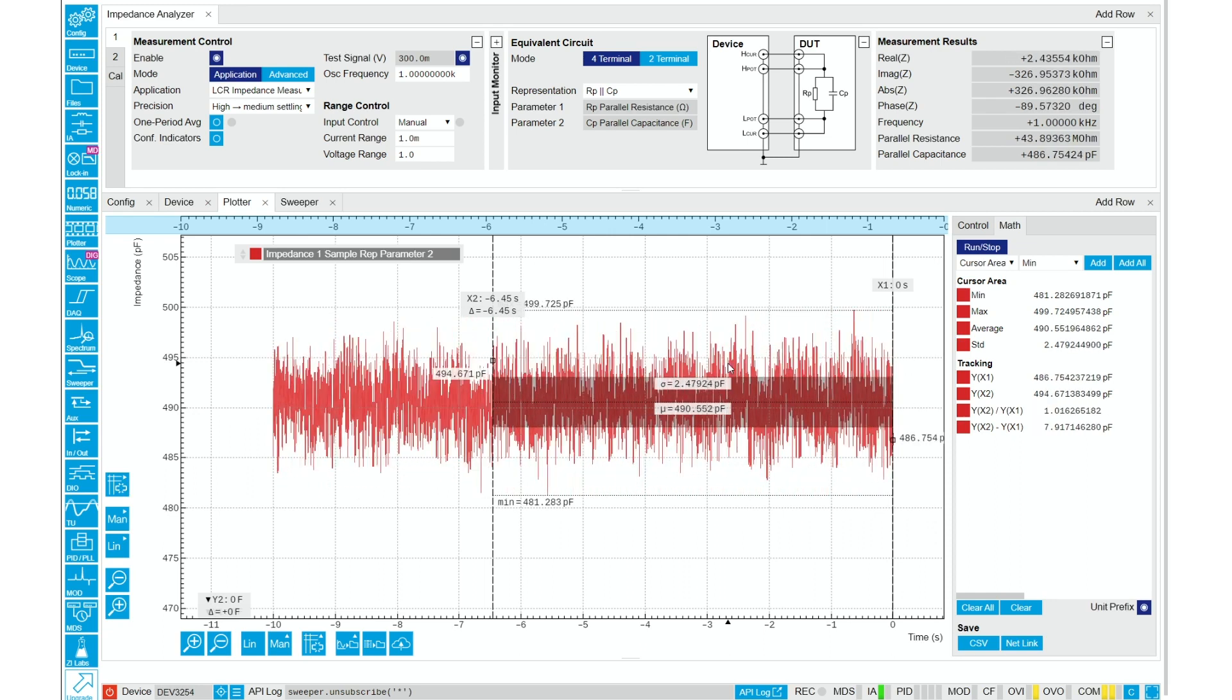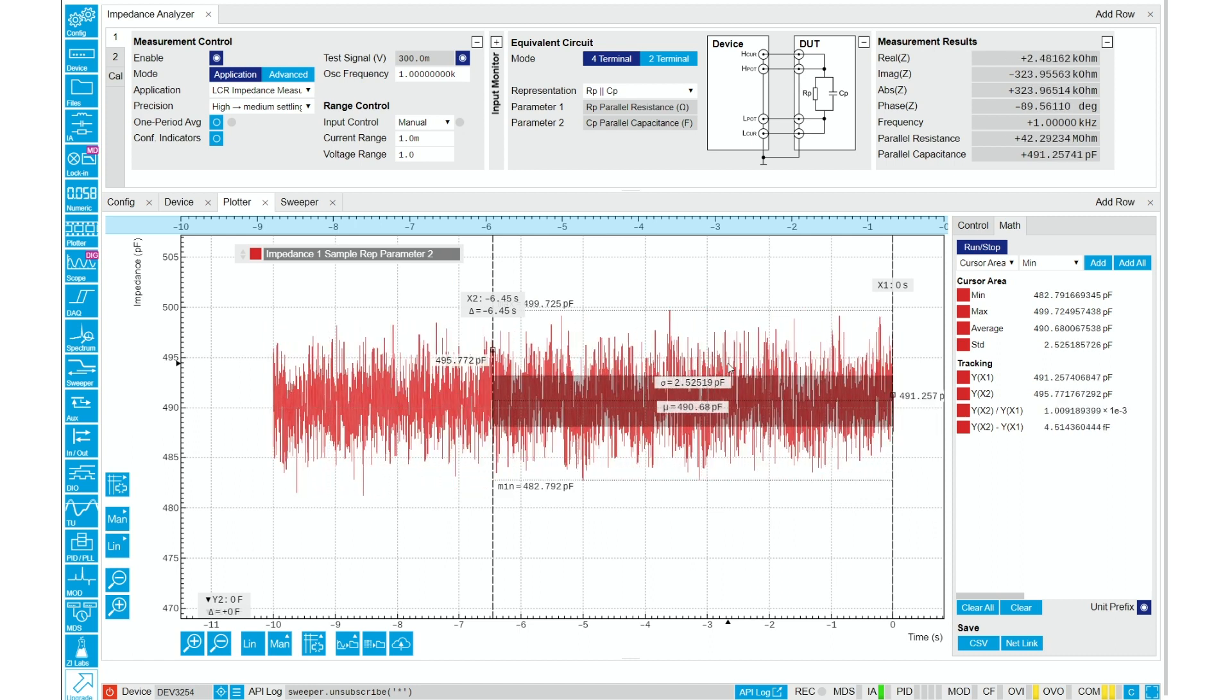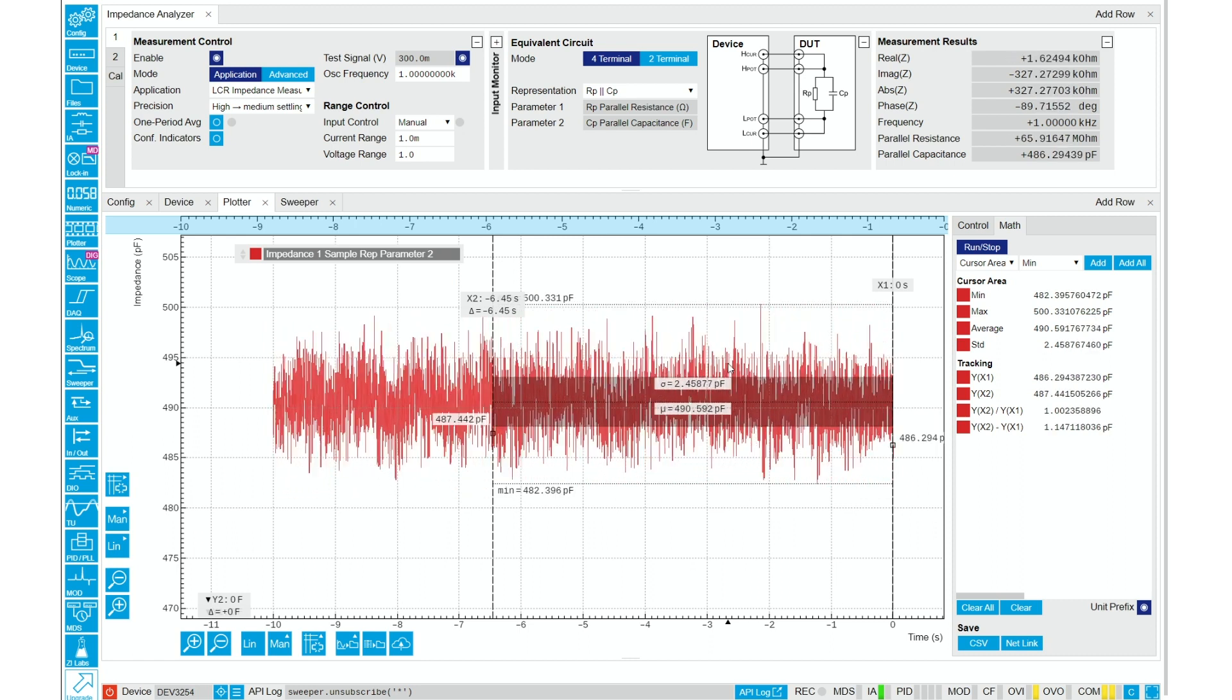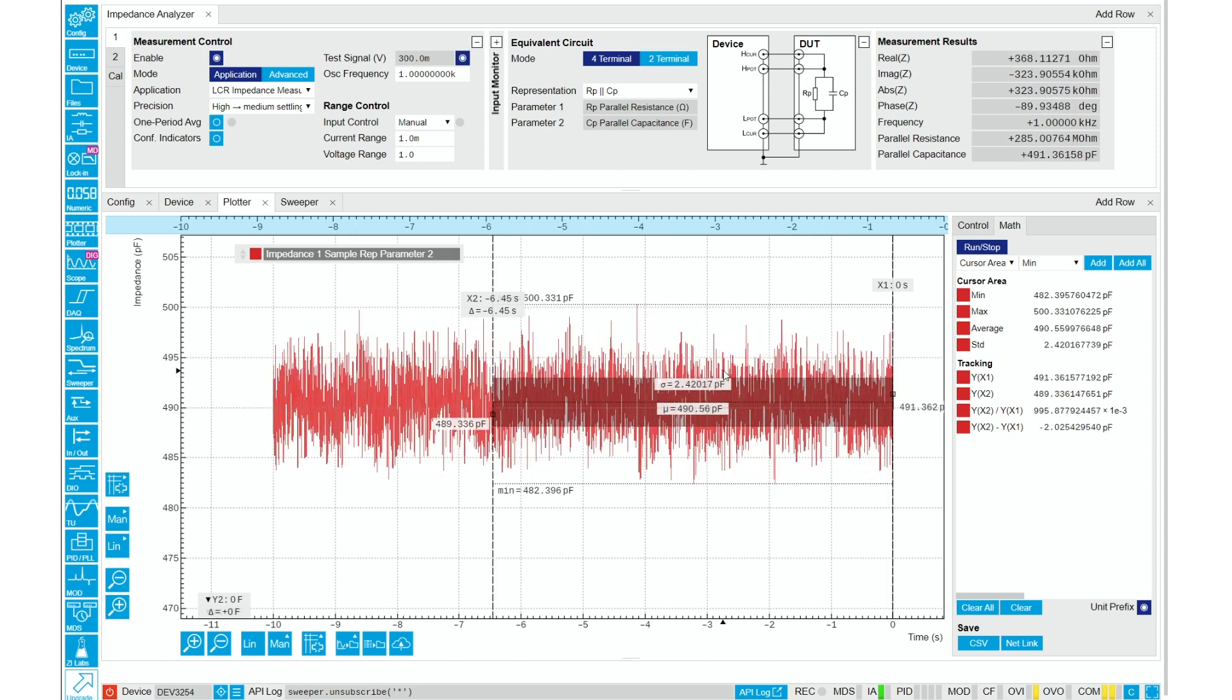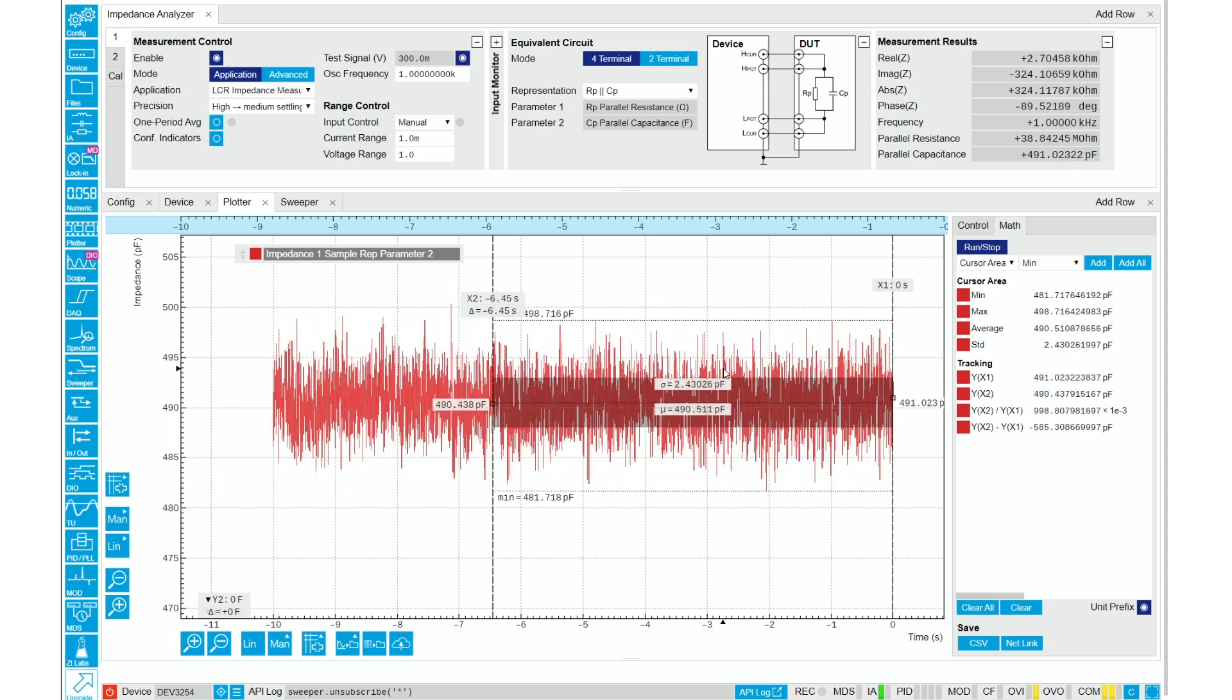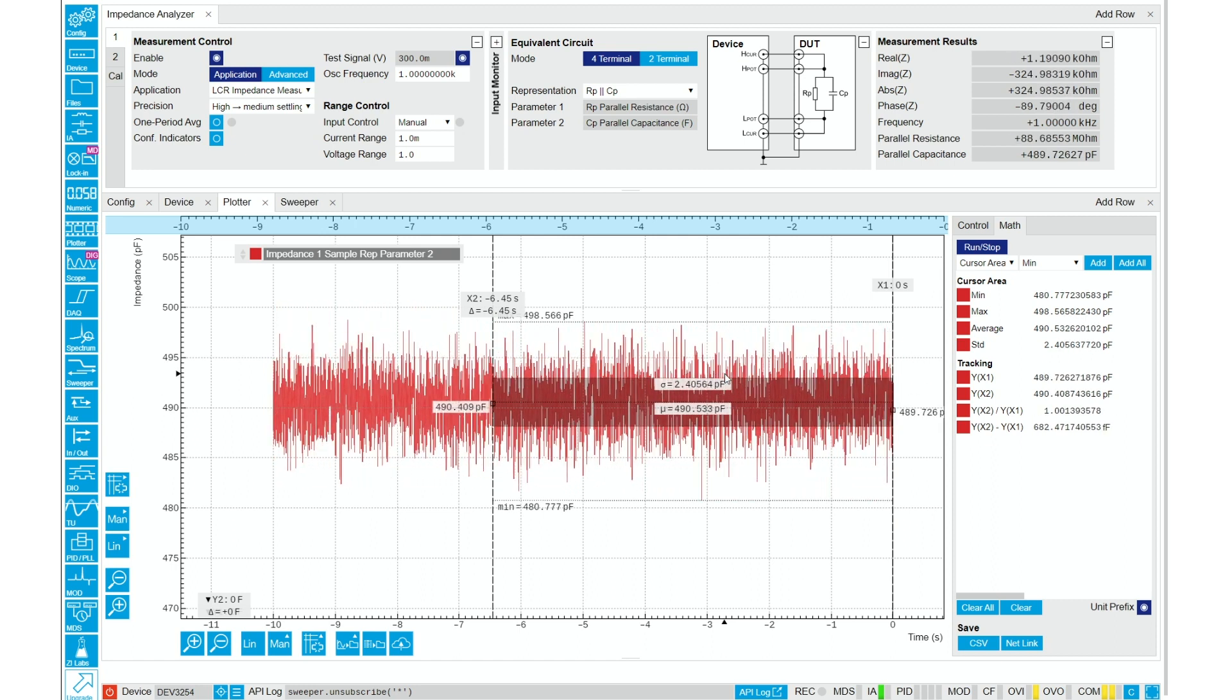An interdigitated electrode is also frequently used to measure thin-film materials. In solid-state measurement, the materials are usually coated atop or laid underneath. In the liquid state, we only need to dip the electrode in.